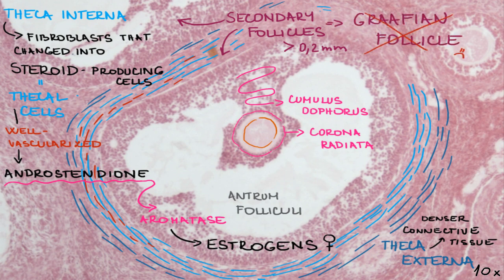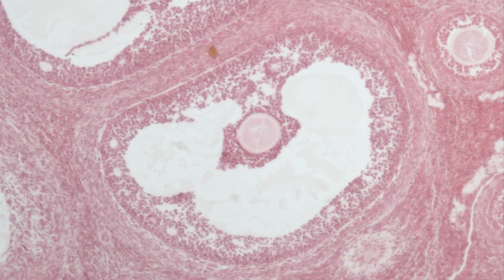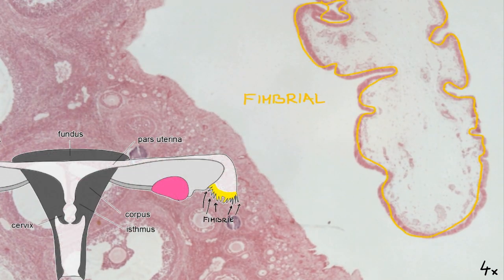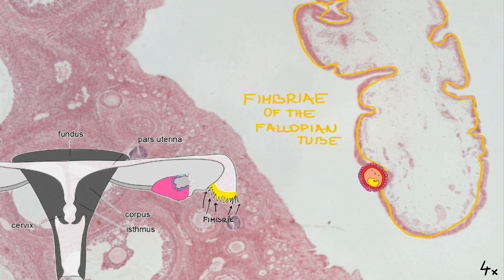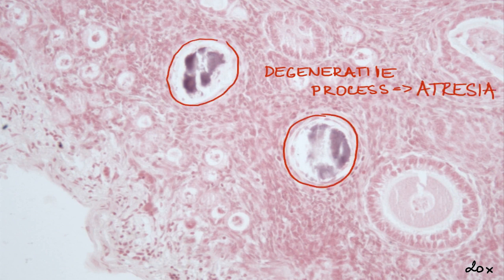We cannot see a Graafian follicle in this section. There is one more structure visible: the fimbriae of the fallopian tube, which capture the oocyte after it escapes from the ovary. Only a certain number of follicles undergo the process of development up to the point of ovulation; most ovarian follicles undergo the degenerative process called atresia. We can see some follicles undergoing atresia here.